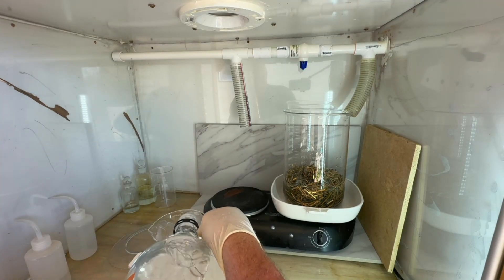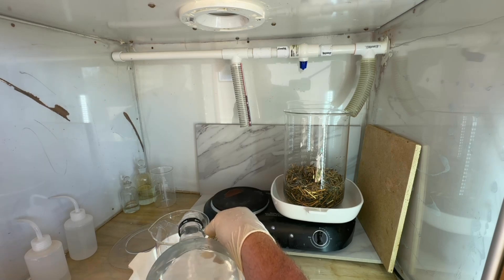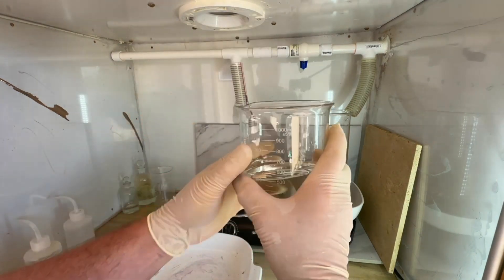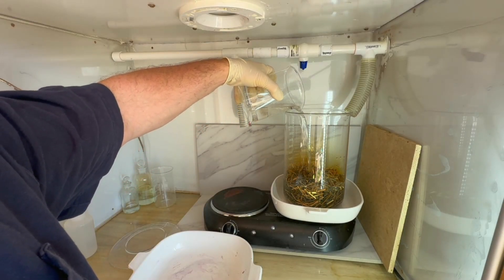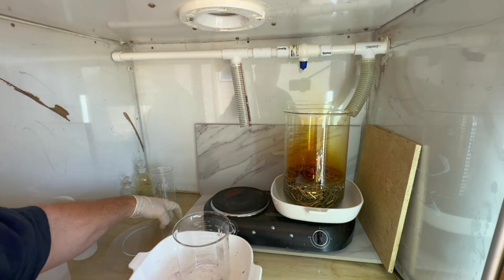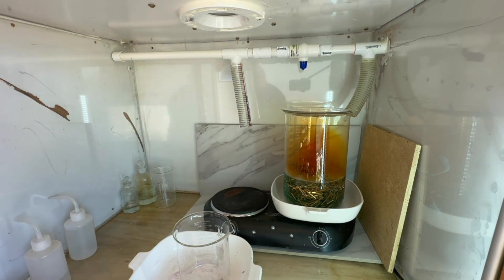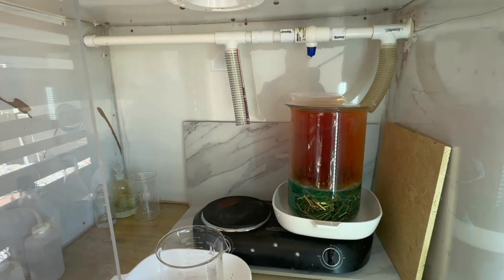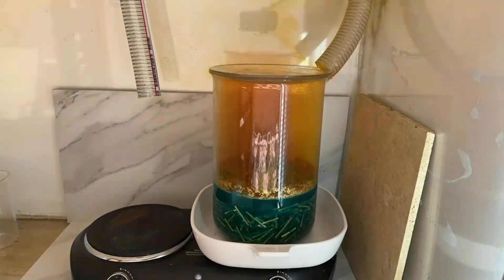We'll add the nitric acid to the beaker and continue additions until the reaction stops and we get no more fumes. You can see it starts to react almost immediately on that copper. I'm going to get this covered up, turn on our fume scrubber, and let the nitric acid do its job. It's important that we get rid of all the copper, or at least as much as possible, in order for this process to work well.